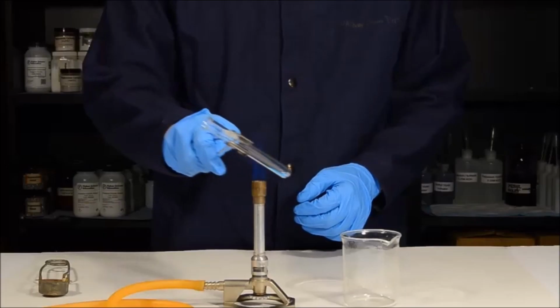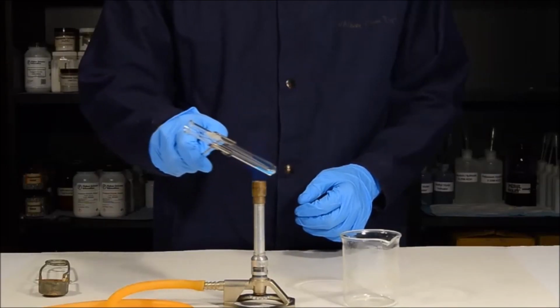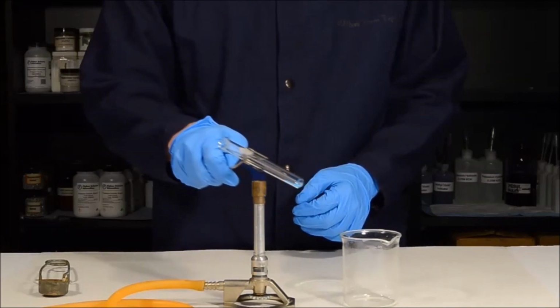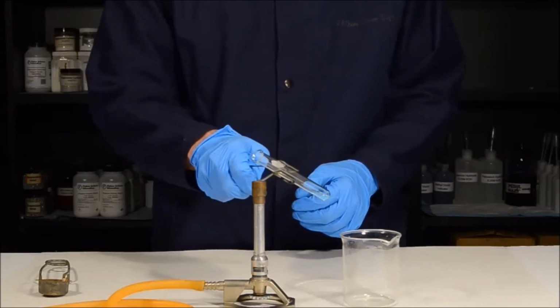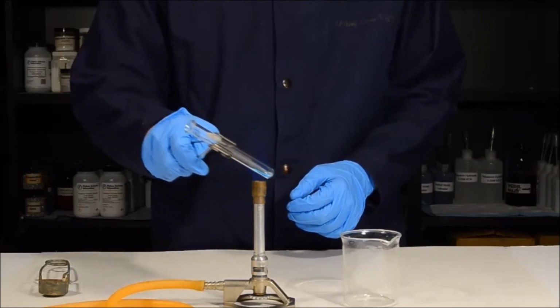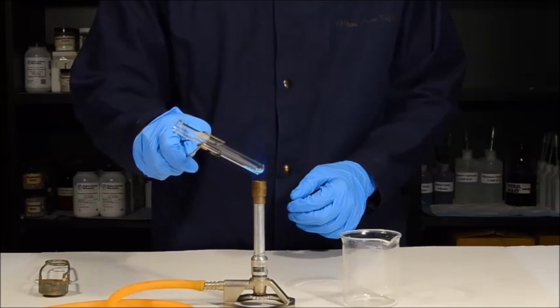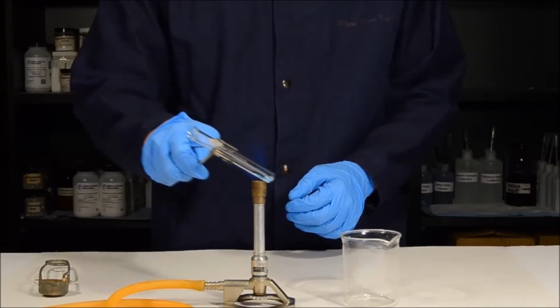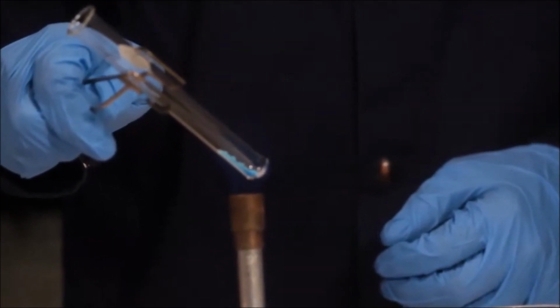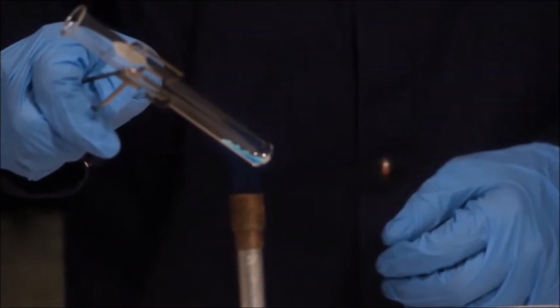It's very important that you heat up the test tube before you heat the copper sulfate because we're trying to dehydrate the water. If the test tube is cold, we will simply condense the water further up in the test tube. So we want to make sure the entire test tube is good and hot before we begin to heat our copper sulfate. Once we've heated the test tube, we then can put the copper sulfate directly into the hot flame.